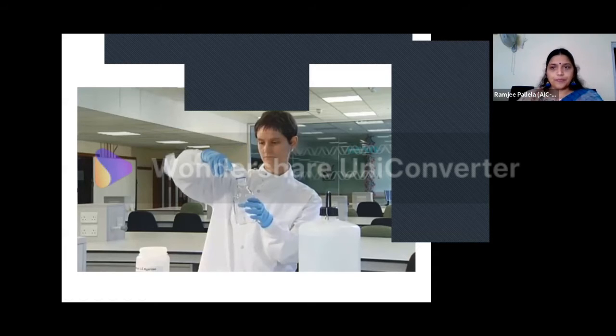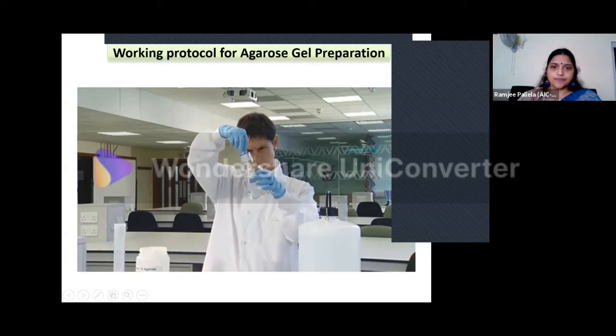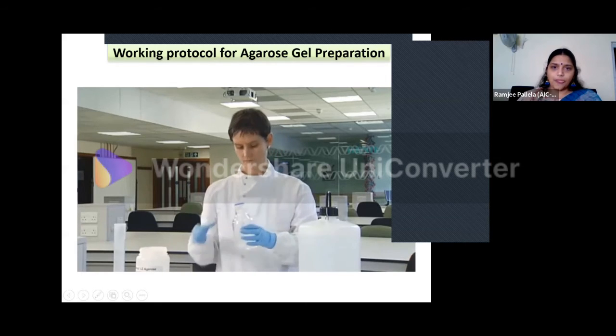Combine the agarose and buffer solution and mix them to make sure that no large lumps of agarose powder are stuck to the container.